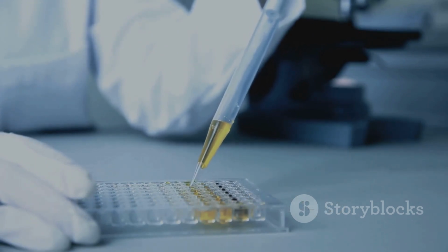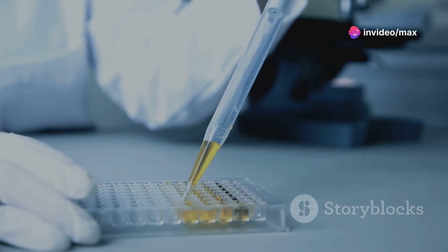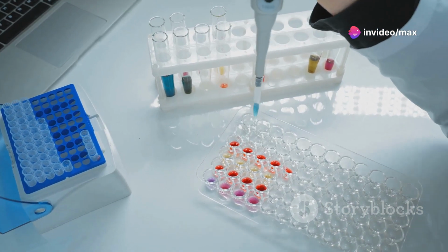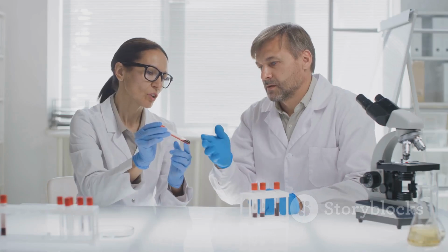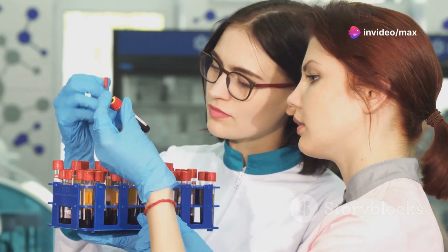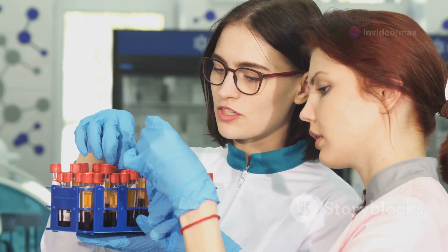Section 6. Sandwich ELISA. Advantages and disadvantages. Sandwich ELISA offers several advantages, making it a popular choice for various applications. First, the use of two antibodies that recognize different epitopes on the target antigen ensures high specificity, minimizing false positive results.